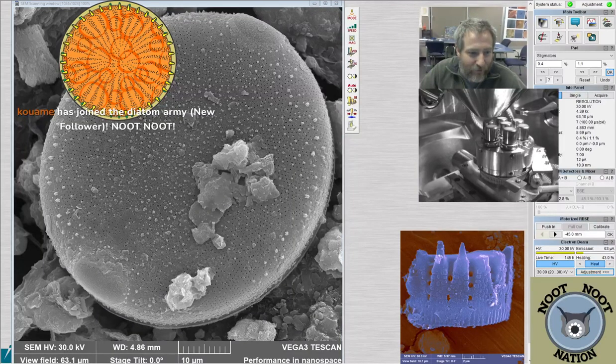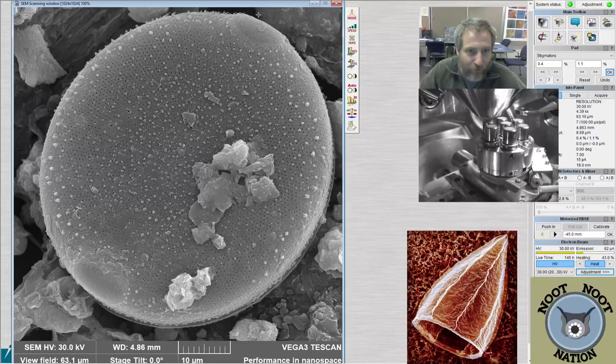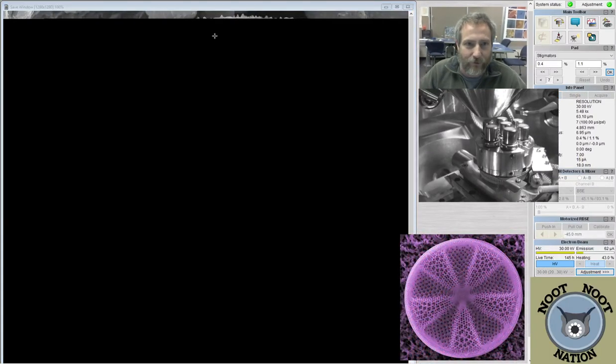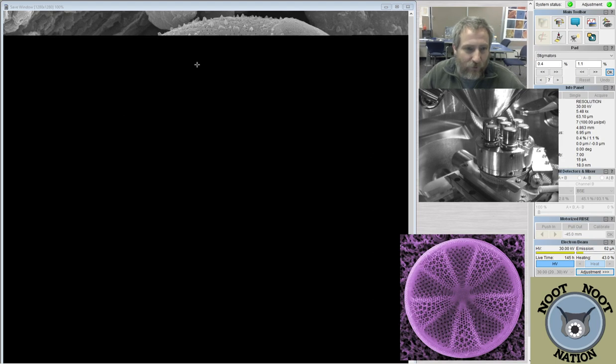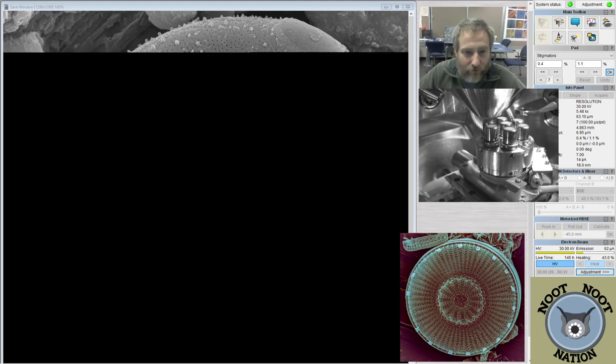These little eye-shaped things that you can see here on the outside edges are the ocelli. They're different shaped, right? Well, this one's a little bit bigger and a little wider. This one's a little bit smaller and a little skinnier. So I'm going to go ahead and collect that image. We are collecting images for a poster for undergraduate research. And so part of my objective for today is actually to collect these pictures. And then ultimately, students will be involved with the research and analysis of these sediments to try to reconstruct the history of the river.